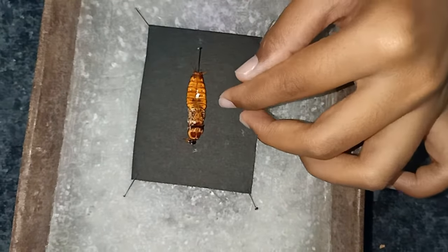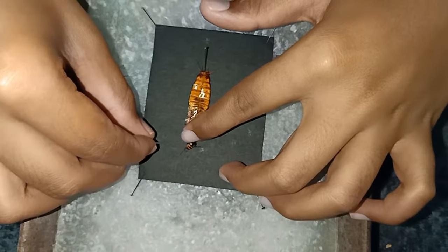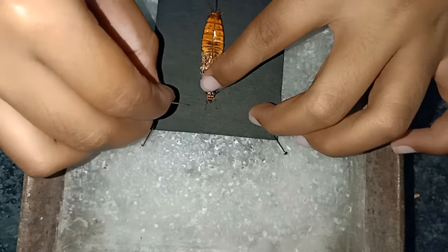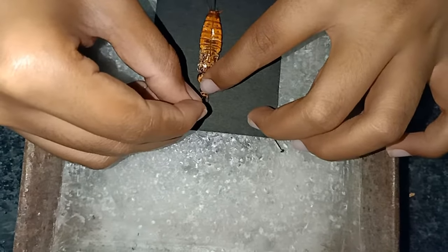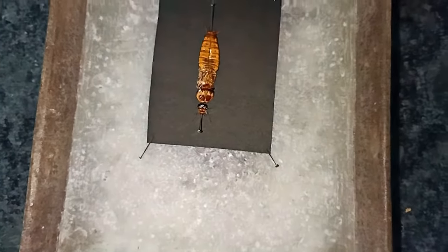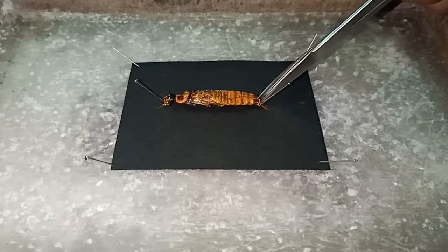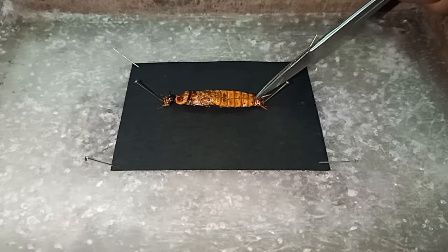In the posterior region, the cockroach must be pinned at the end of the 9th abdominal segment. The pinning must be done tightly so that it gives ease in the dissection. In the anterior region, the cockroach must be pinned at the tip of the head where the mandibles are present. An important note, please make sure that your cockroach is not overstretched, which will tear up the specimen.